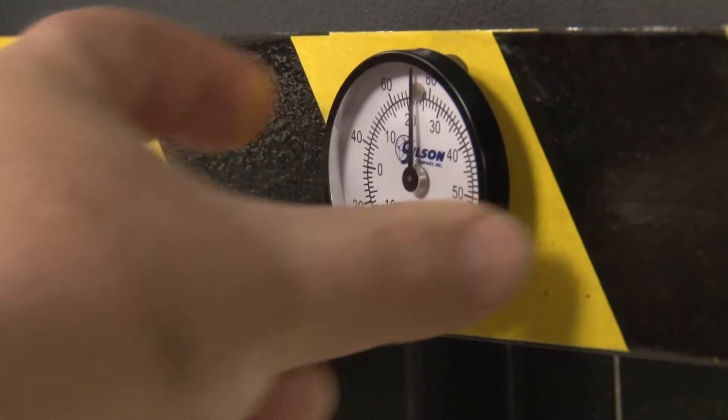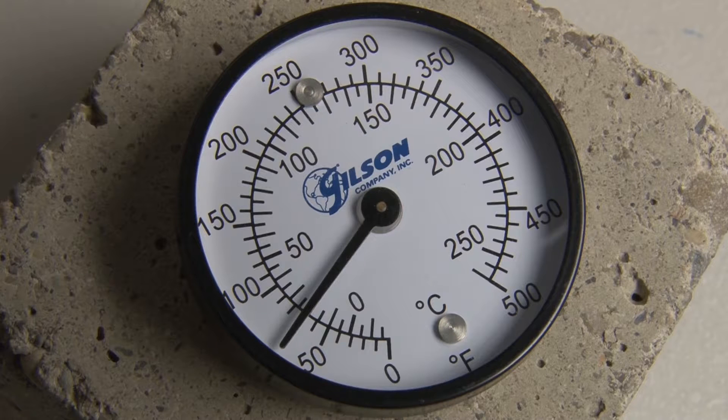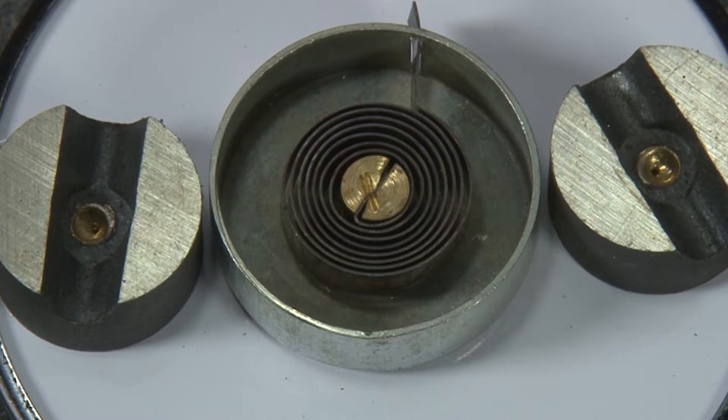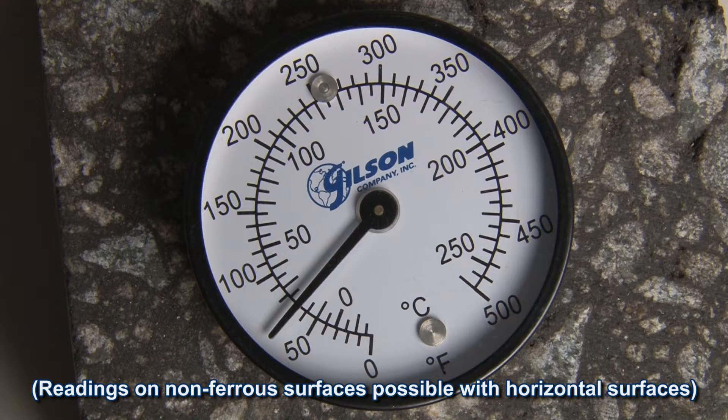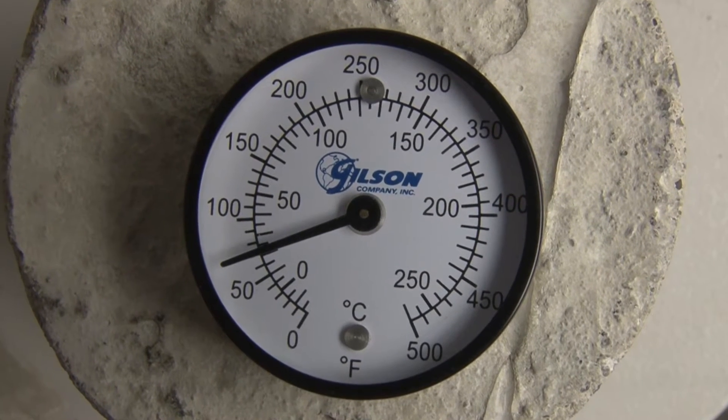This handy gauge is a useful tool in sensing the temperature of almost any surface. Place the gauge on the surface where you wish to determine the temperature with the bi-metal sensing element against the surface. The integral magnets allow placement on any flat ferrous surface, and once the sensing element stabilizes, the temperature reading is ready.